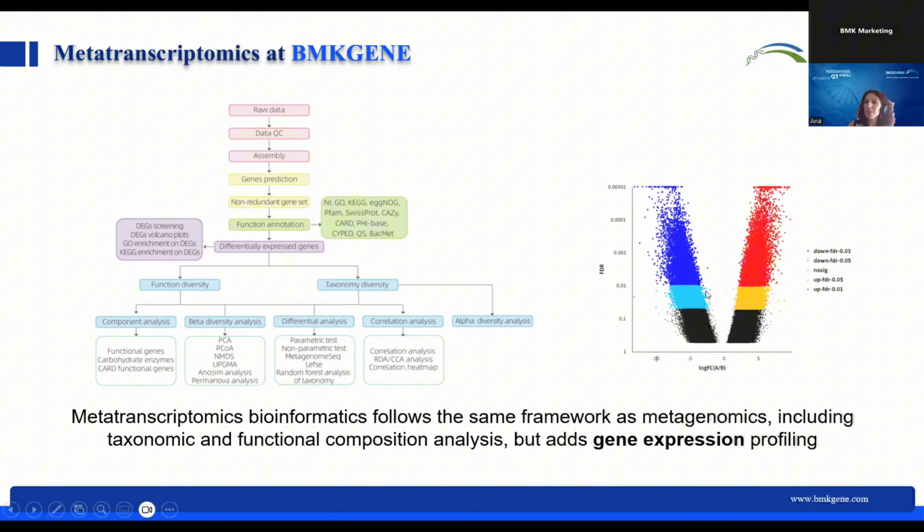So we get volcano plots like this, where we can look at the up and down regulated genes and then do some functional enrichment of these genes with gene ontology and KEGG.